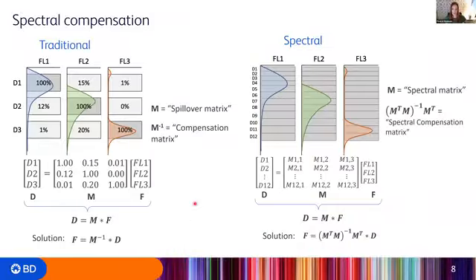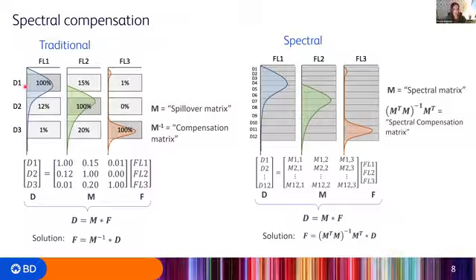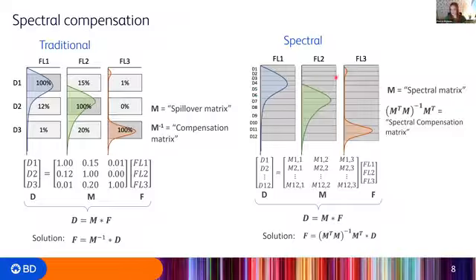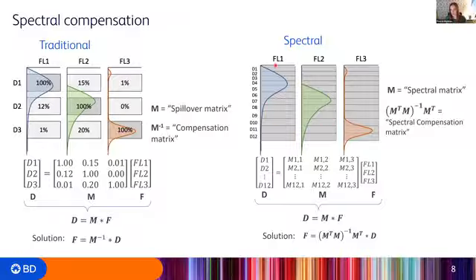There's a lot of math involved, but both approaches are trying to understand the contribution of each individual dye. With traditional compensation you get a square matrix — one color per detector used. With spectral cytometry you get a rectangular matrix because it's an overdetermined system with far more detectors than colors in the panel. That's one way to tell what kind of compensation has been done inside FlowJo: square means traditional, rectangular means spectral.